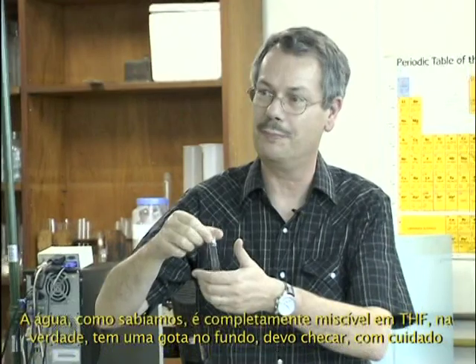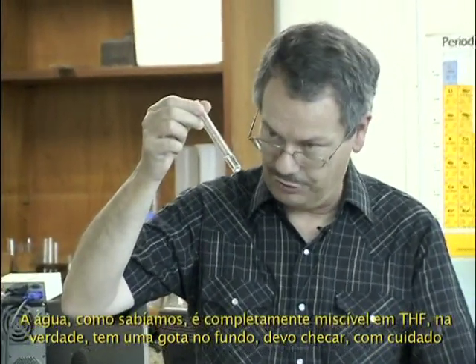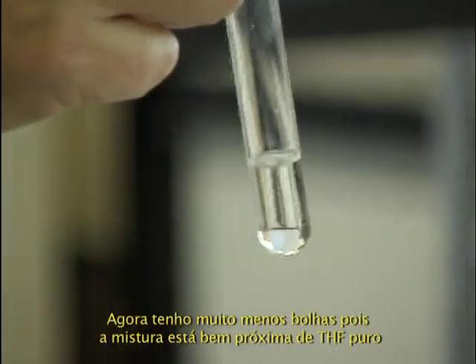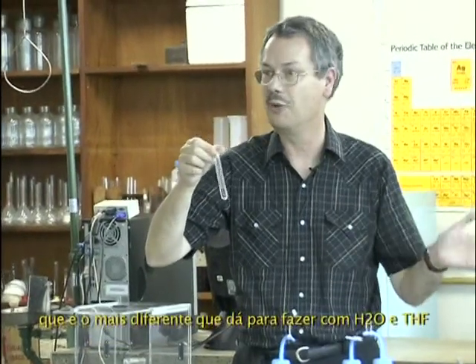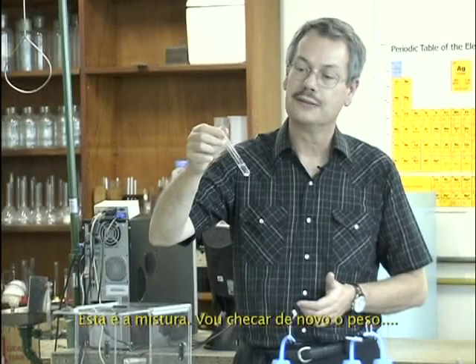Actually, it's just a drop at the bottom, and I should check it carefully to be sure I have a homogeneous mixture. I have much less bubble because this is very close to pure THF, 10% water in the THF. So the gas solubility is not that different from 50-50, which was the most different you can go between water and THF. So this is the mixture.